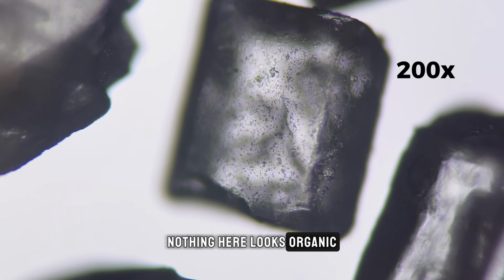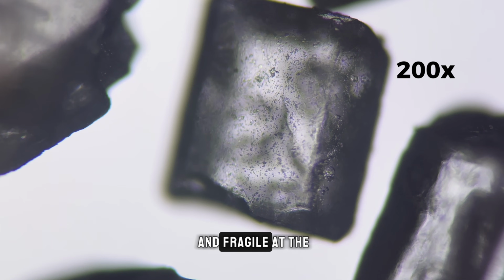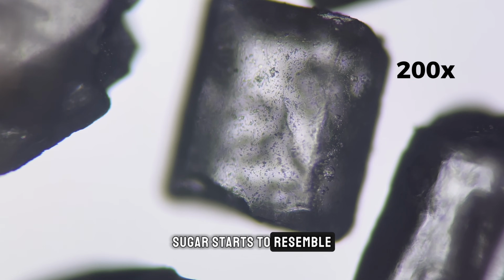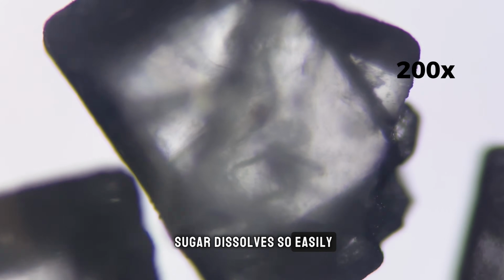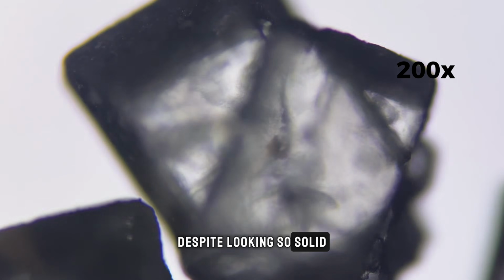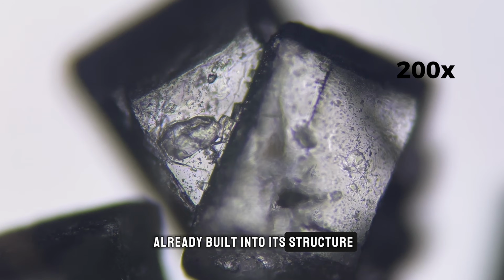Nothing here looks organic or soft. The structure feels engineered and fragile at the same time. At this scale, sugar starts to resemble shattered glass more than an ingredient. It becomes clear why sugar dissolves so easily despite looking so solid. The microscopic weaknesses are already built into its structure.